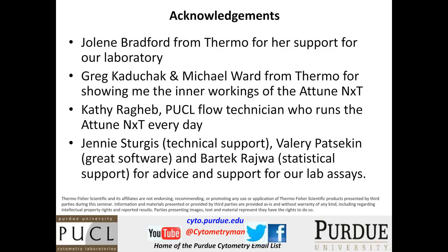The combination of the two just works better. When you build systems and prototype them, you find out what works better, and I suspect that was developed through many prototypes. We know that hydrodynamic focusing works well, and if you combine the two, then you get a much better system.